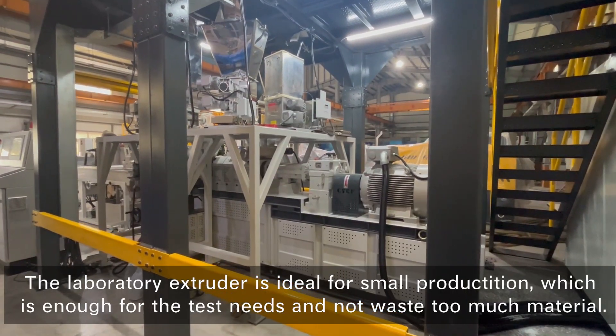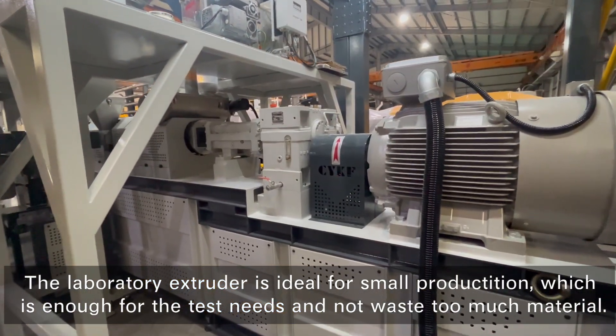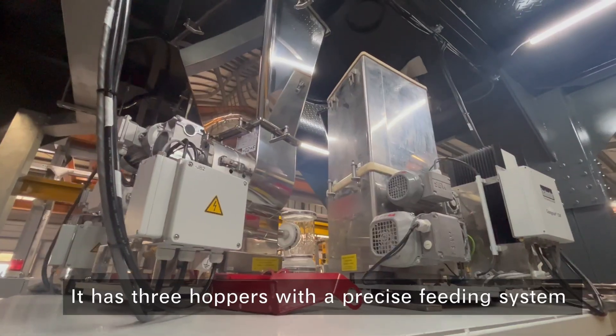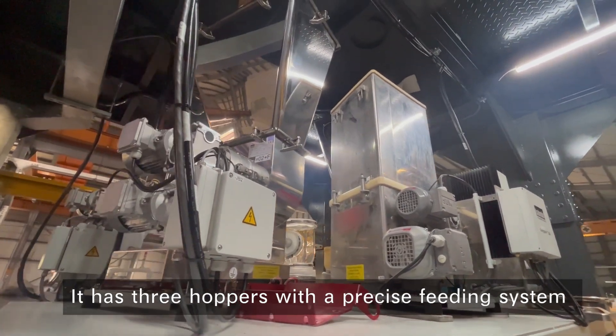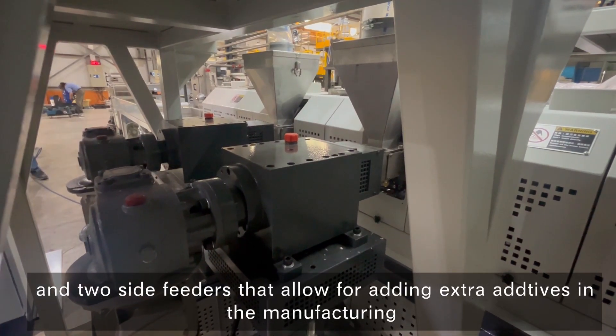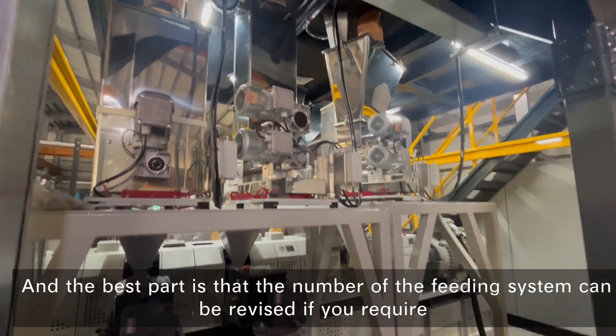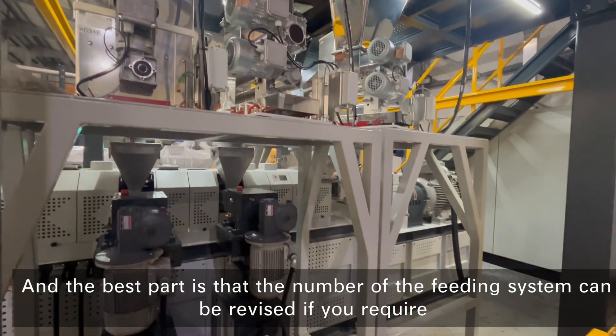The laboratory extruder is ideal for small production, which is enough for test needs and does not waste too much material. It has three hoppers with a precise feeding system and two side feeders that allow for adding extra actives in the manufacturing. The best part is that the number of feeding systems can be revised if required.